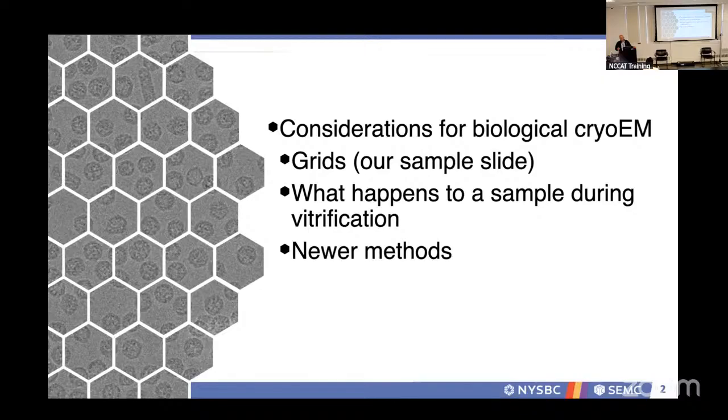I'll give you a hypothetical idea of what will happen to your sample during vitrification, and we'll touch upon a few newer methods. Tomorrow we'll get to see some of the newer methods from blot-free vitrification, which I'll mention in a little bit, all the way through to some of the focused ion beam sample preparation techniques.